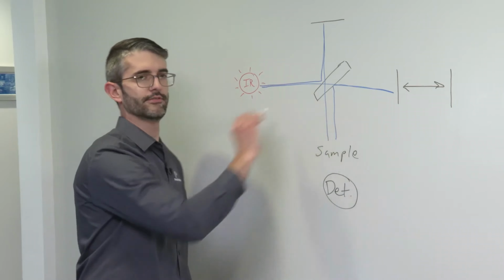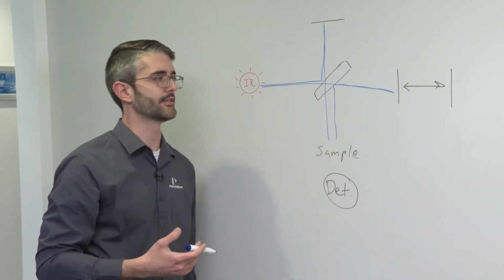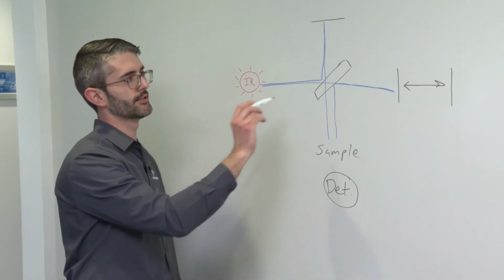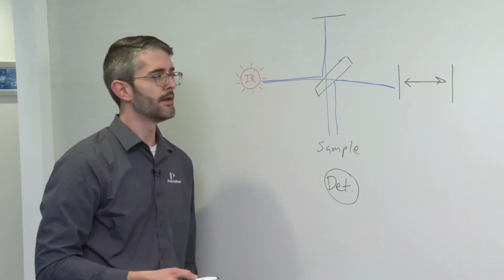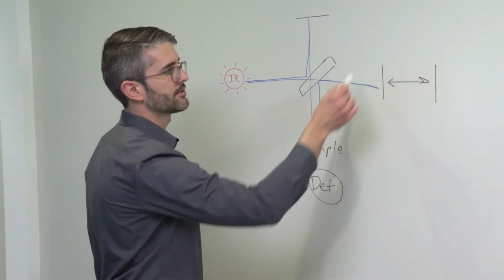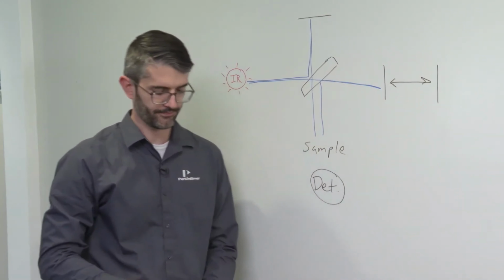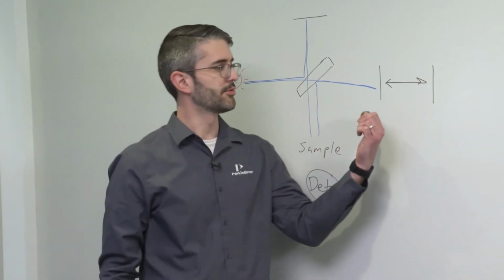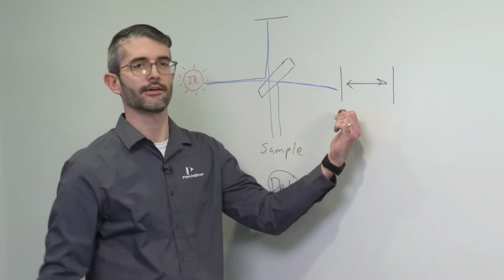It's the interference of this light which produces what is known as the interferogram, which is the raw signal measured as part of the infrared measurement of a sample. Now in this design, the optical path difference must be changed to cause interference by this linear moving mirror. This moving mirror moves along a track, reflecting infrared light back.